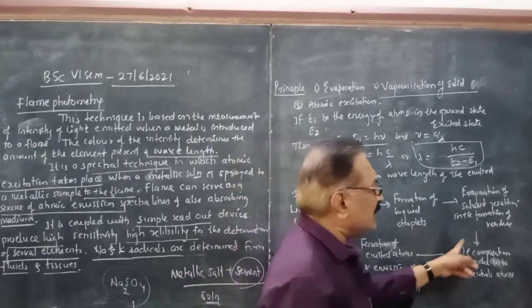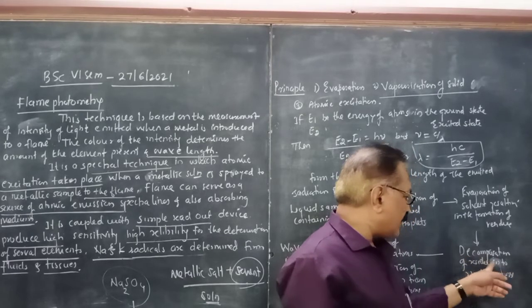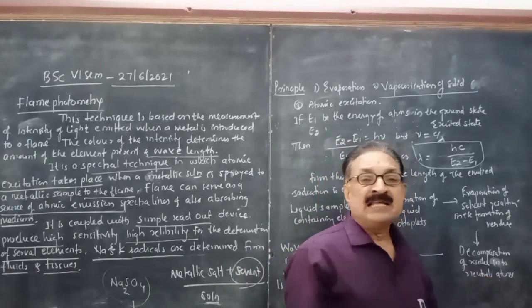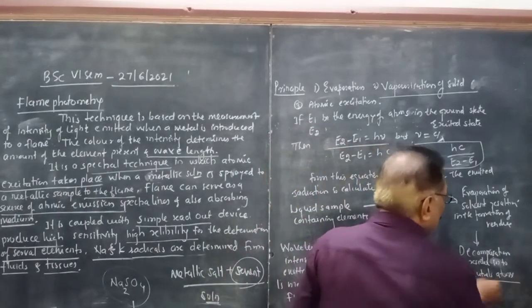Then what happens when that compound continuously comes in contact with the flame? The decomposition of the residue takes place, and neutral atoms are formed.